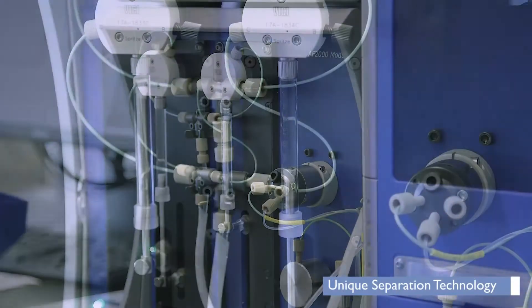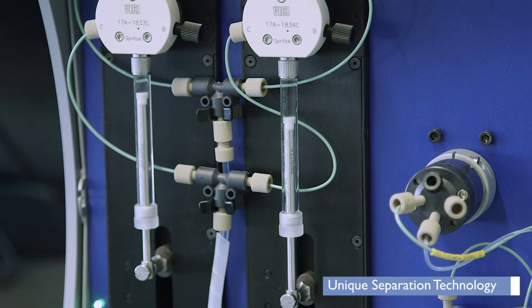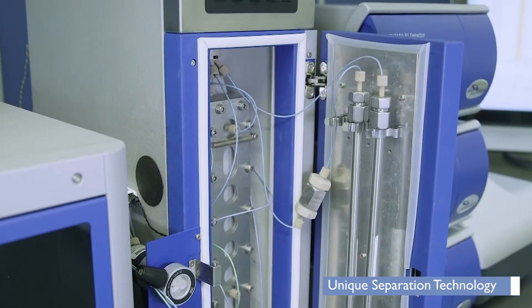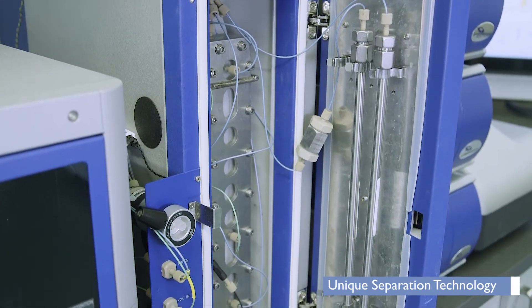The Postnova AF2000 separation technology is unique because all flows are controlled directly by pumps, avoiding the use of any control valves.